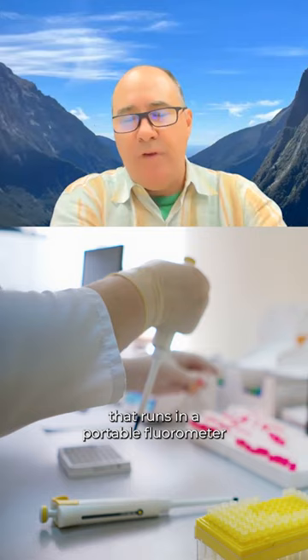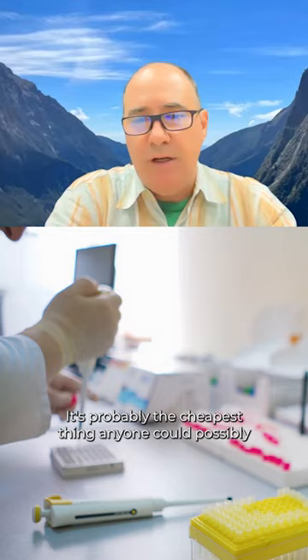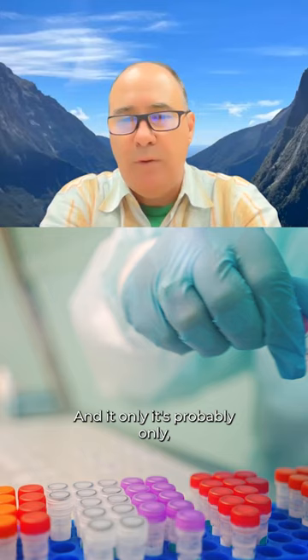This is something that runs in a portable fluorometer that's smaller than a PCR machine. It's probably the cheapest thing anyone could possibly put into a cannabis testing laboratory, and it's probably only about 10 bucks a sample. So it is really fast and cheap to run this.